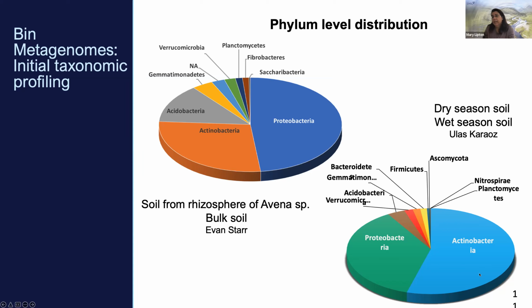But it just means that in this case, when we add glucose, and I apologize for my formatting, when this moved over to my new template, not everything worked. Obviously, when we added glucose, it spurred responses. The actinobacteria actually responded to the glucose by synthesizing more proteins.